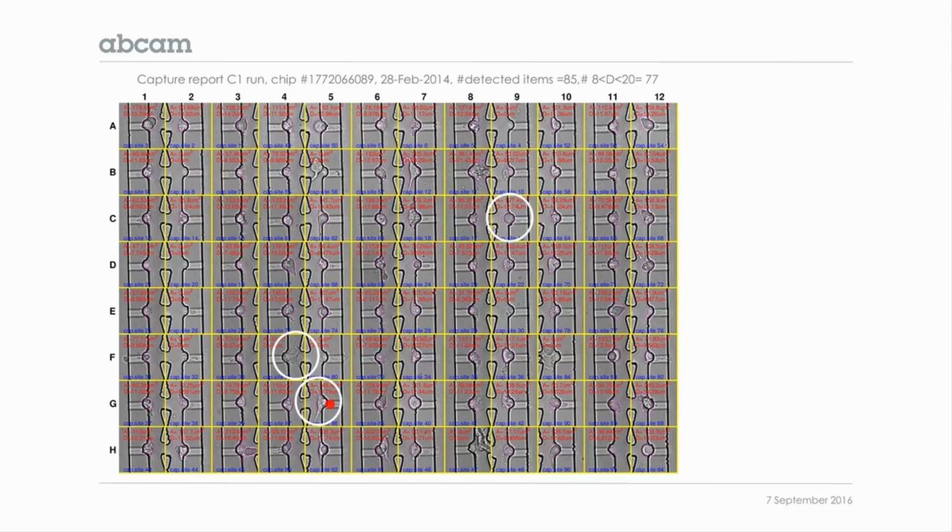And we can also know where there are cases that it's not a single cell, or it's not a cell at all, or it's a dead cell. And then we can eliminate those cells and avoid analyzing them. This is very important in single cell analysis to avoid all cases of doublets. So this is the second nice advantage of this platform.